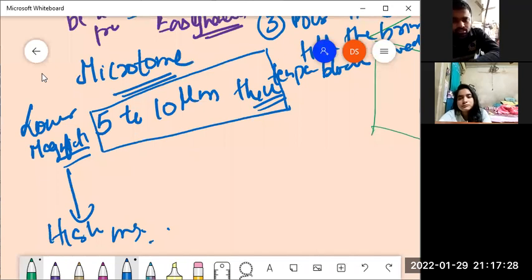Now, the higher the magnification, the more the broader or larger details are lost. The more we move to higher magnification, the thinner the slices are required to be. If we have to stick to the gross, then this amount of thickness is sufficient.